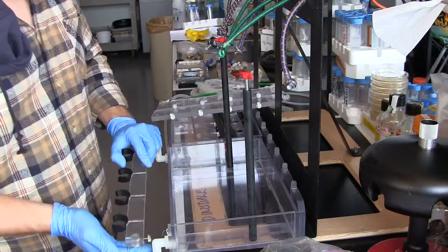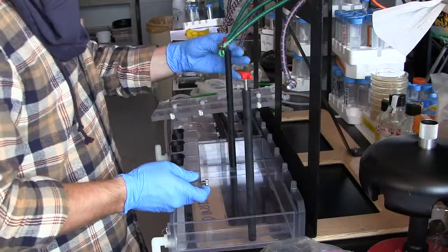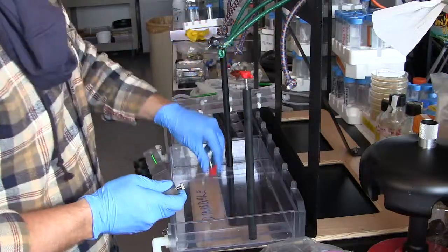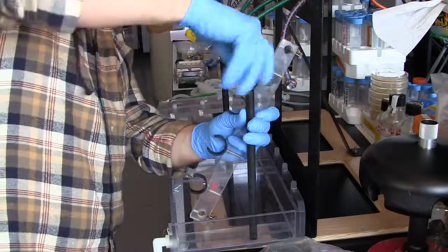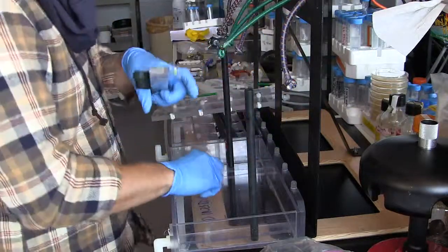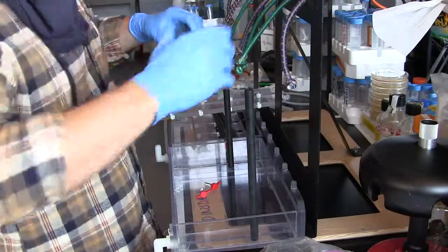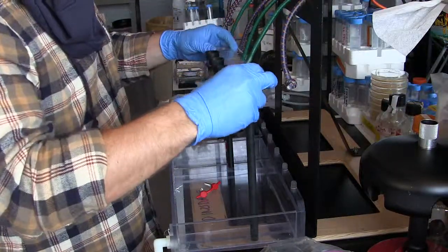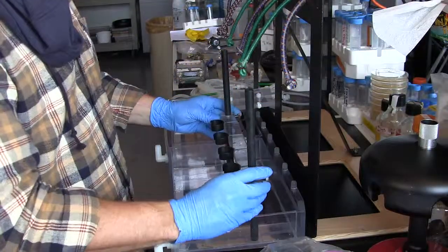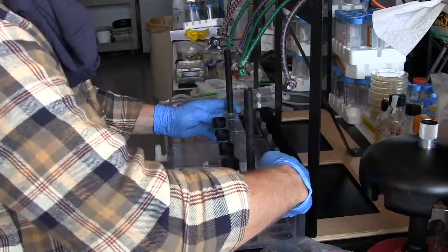Alright. Next thing you want to do is you want to take the sample holder. Now, where the valve comes out here is the front of the basin. What you want to do is you want to give yourselves a little room here by taking these off. Okay. You want to slide this piece of plastic over these poles and slide it down to around about here. We can fix it later and adjust it as we want.